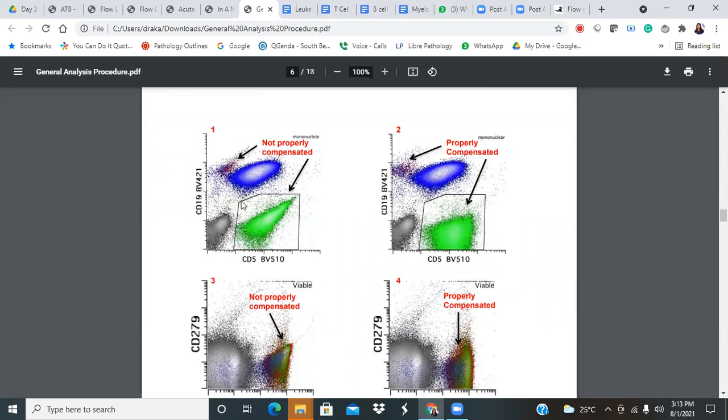And I think Rajeshwari in the morning mentioned very nicely about this triangular appearance. Why does it appear? Can you repeat that, Rajeshwari? Are you here? Oh, sorry, I was muted. So we say it is like a diagonal shape, or some people describe it as rocket shaped. It means that it is in between the two antigens, like in the midline, and it is not committing itself to either of the two antigens in that plot.